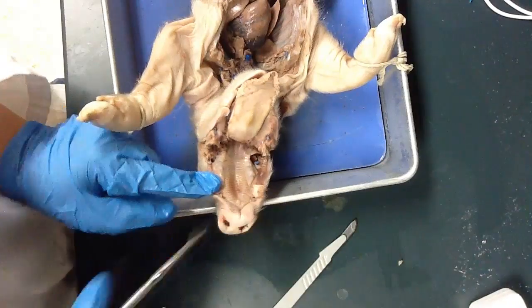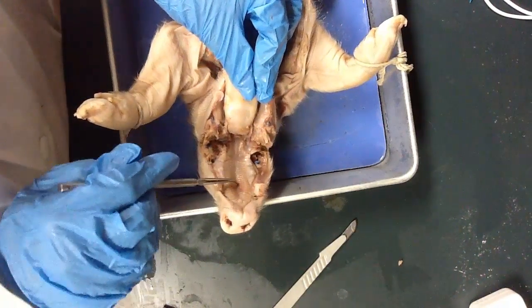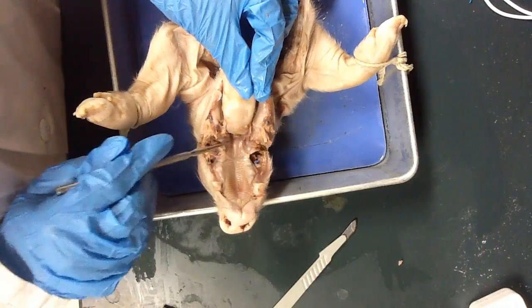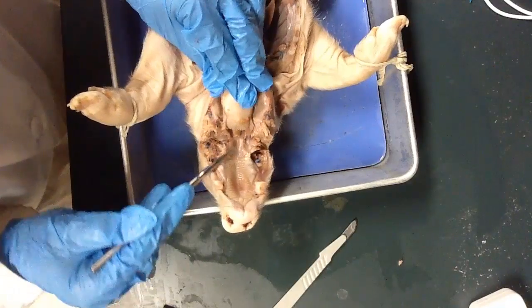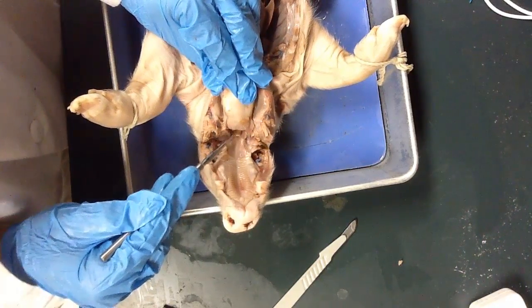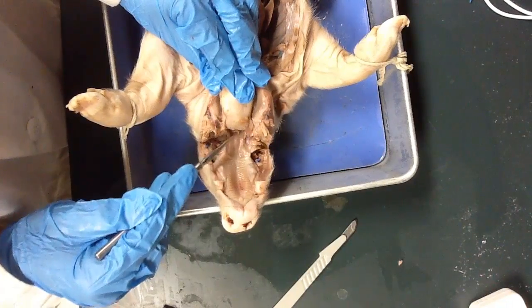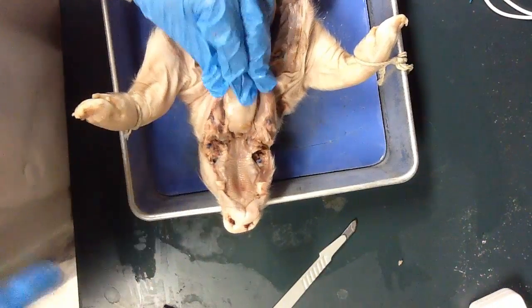There are not quite as many teeth as you might think there are. We have the hard palate, which is this hard bumpy part. And then we have the soft palate, which is this part right here that helps the pig swallow. And then we have the epiglottis, which is this little flap. That's what's going to help keep the pig from choking when it goes to eat — it helps the pig differentiate between the trachea and the esophagus when swallowing is happening.